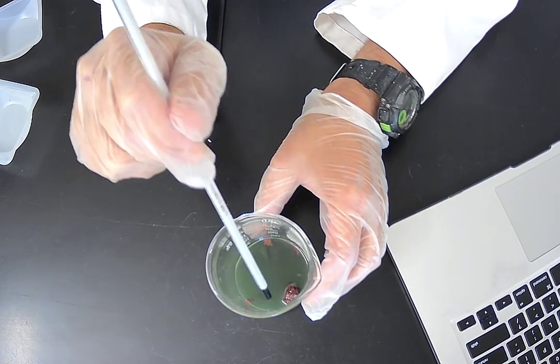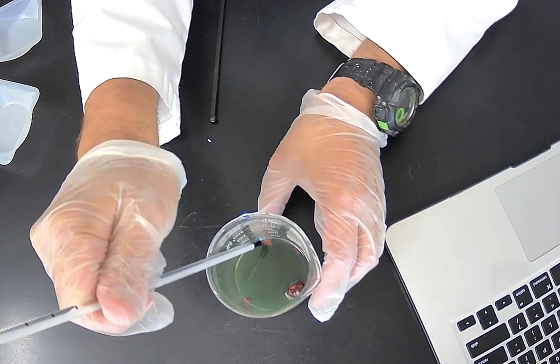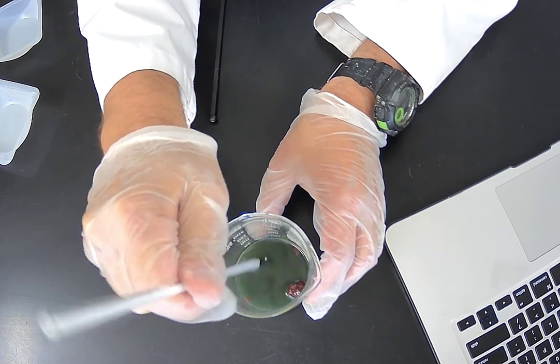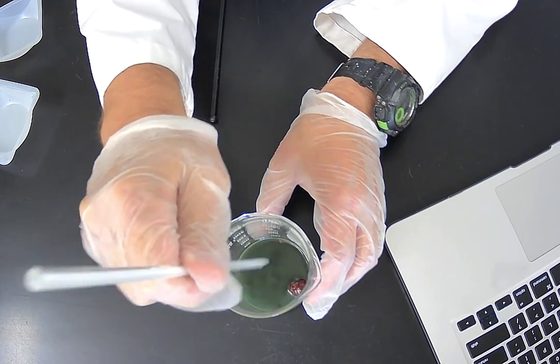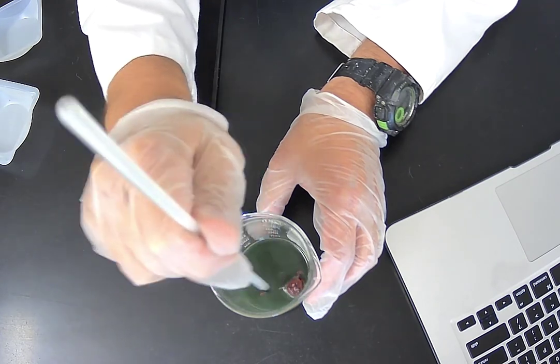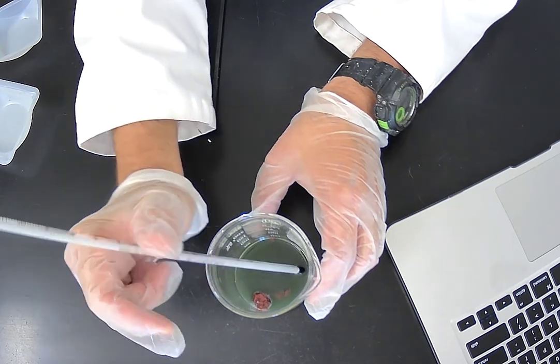You can see the brown chunks right in there. You see that where the thermometer is pointing to? And we no longer have this clear blue solution. We have sort of a greenish, murky color going on here.